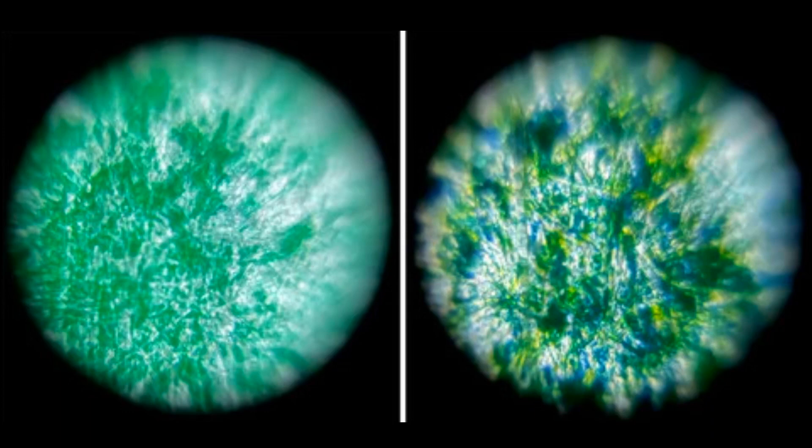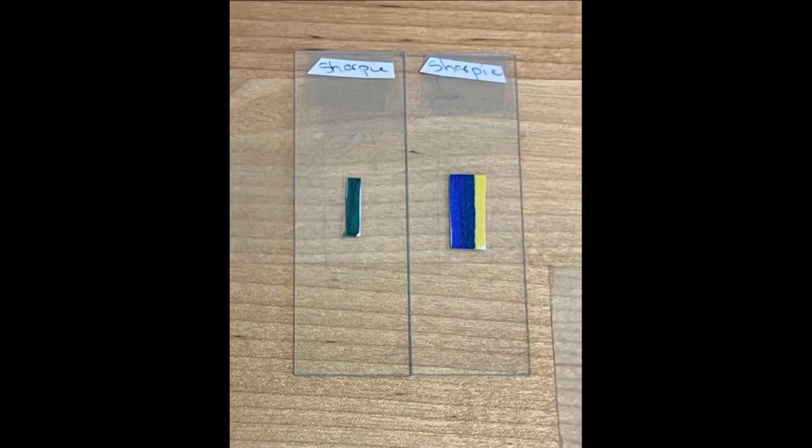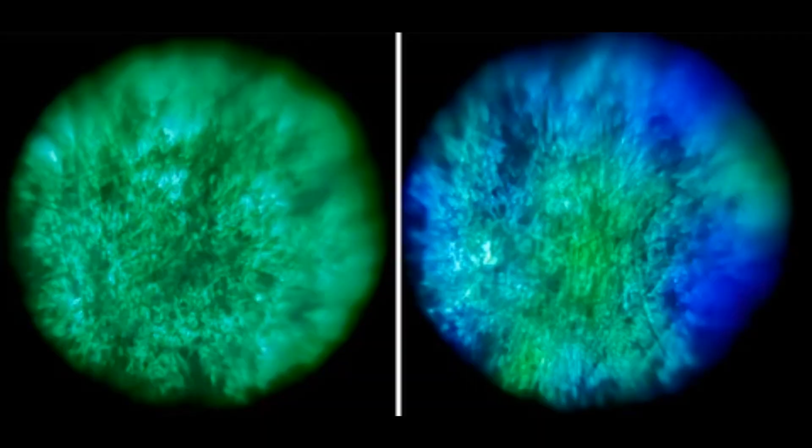The next step to test how well colors mix under a microscope was to use a permanent marker. These pens usually coat paper so well that the color bleeds right through to the backside. As evidenced, the color on the paper is much more intense when using a permanent marker. In the microscopic images, there were no white paper fibers visible with the permanent marker. However, the separate yellow and blue pigment was still able to be seen under the Foldscope.